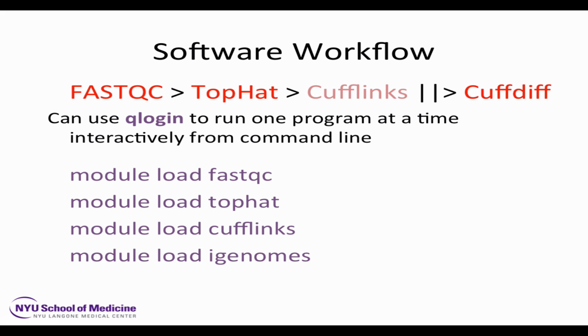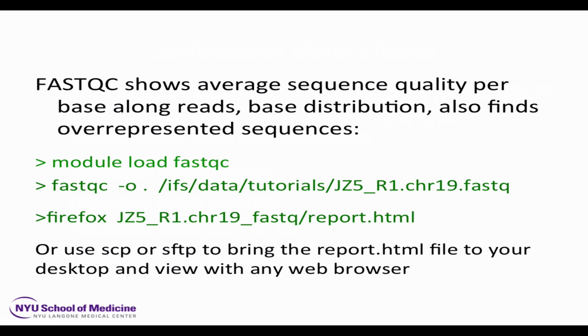This is just describing what we're going to do. First tool I'm going to talk about, and you can run for yourselves. It's not a huge success-fail thing. You can also come back and work at this tomorrow and the next day, when you want to dust this off and really get good at it.